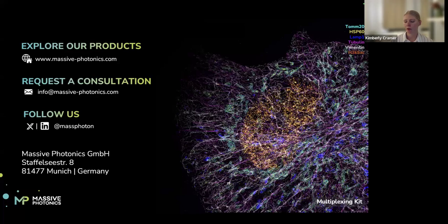So in this way, when you first start, it's very nice to start with a GFP, but if not, don't worry. It doesn't take so long to get trained on this. And if you have, for example, a 3D lens in your microscope, you can use this to set the focal plane very nicely. Yeah, so I would say that the longest part would be getting used to this imaging, but the rest is quite similar. It's for people who have done SMLM before, and if not, it's not too hard, and if you have any issues, you can contact me.